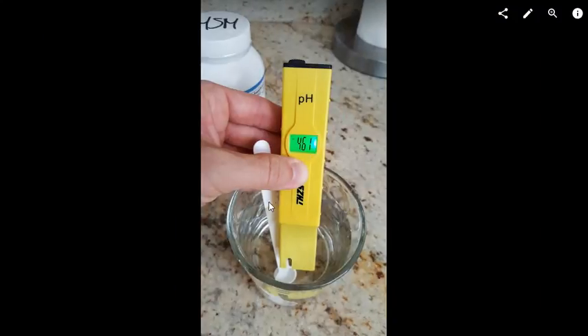So I took a glass of tap water, put in a quarter teaspoon — like the scoop delivered with the Bronson vitamin C — dissolved it, and waited until the pH value was somewhat stable. Then I measured it with the pH meter.